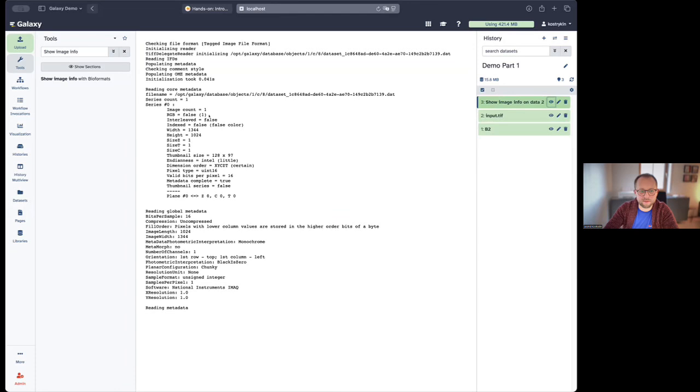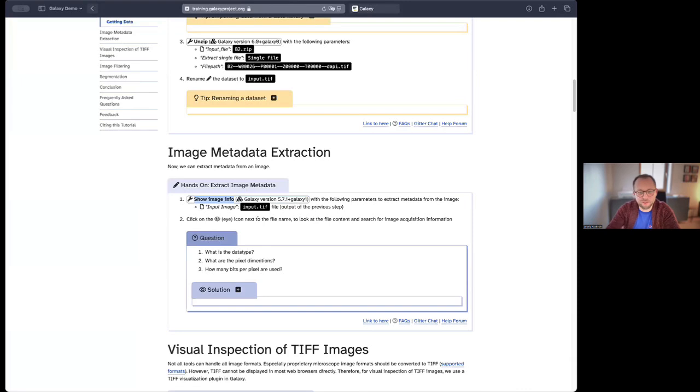We can see that it is a grayscale image. And I think there's also the number of bits per pixel in the color channel. So it's a 16-bit image. And this is also the reason probably why the contrast of the image is so bad, because the range of possible values is quite large. And so it's not an 8-bit image, but a 16-bit image.